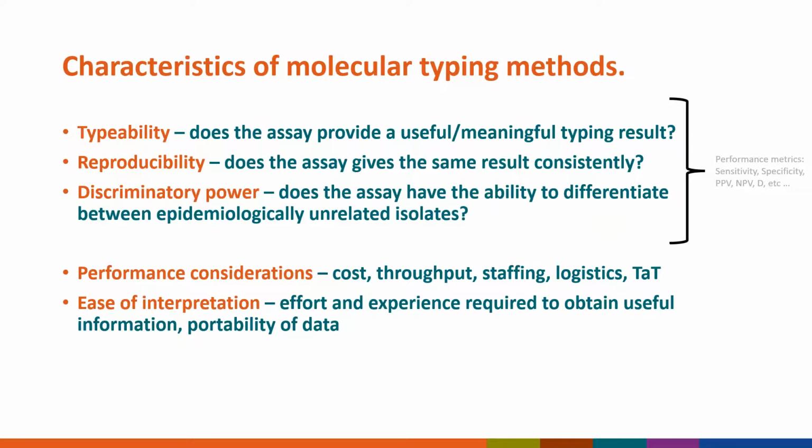Reproducibility is another critical factor. If a technique gives different fingerprints or different patterns, different determinations each time it's run, it isn't a reliable technique, and it can be very difficult to use those kinds of approaches to actually consistently analyze and interpret data, especially when you're doing it across multiple labs.